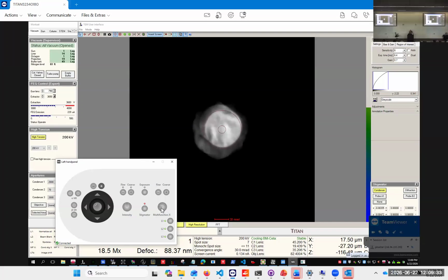Try that on your microscope. If that is not the perfect focus, then this is the normal behavior of an astigmatism in the Ronchigram. So you have this deviation, but you also have a change in focus because the disk of least confusion is moving out from the back focal plane, okay?